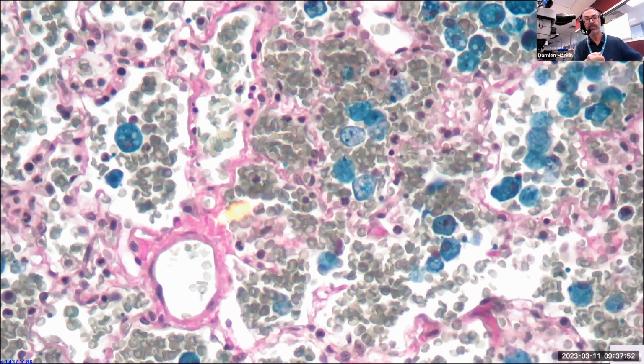But in combination with that, we're getting a sort of a bluey coloration from the residual iron, the ferric ions that are there. And so they are obviously giving a light shade of blue on top. So what we're actually looking at here is a combination of the picric acid being yellow combined with probably some background staining for the residual iron that's there. And that gives you this kind of green color.